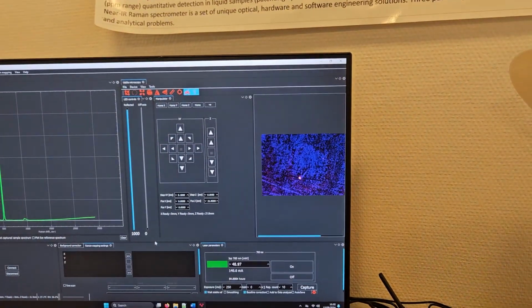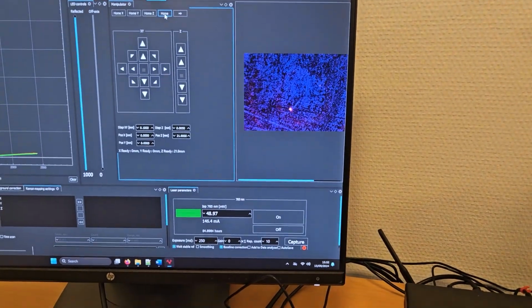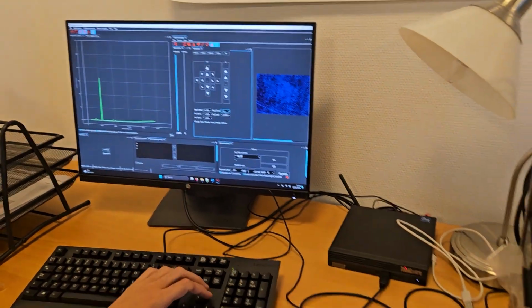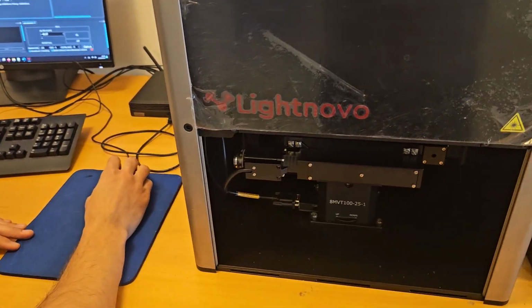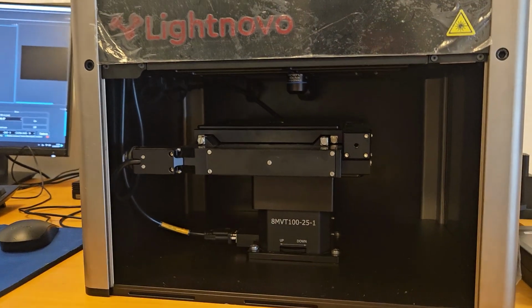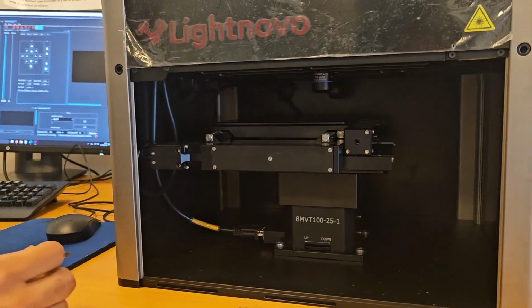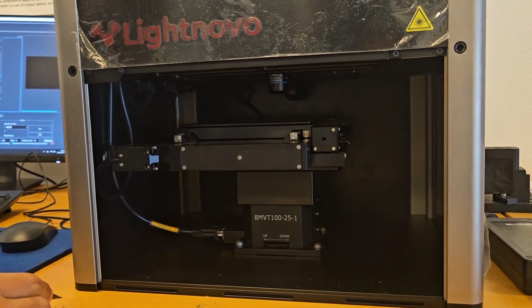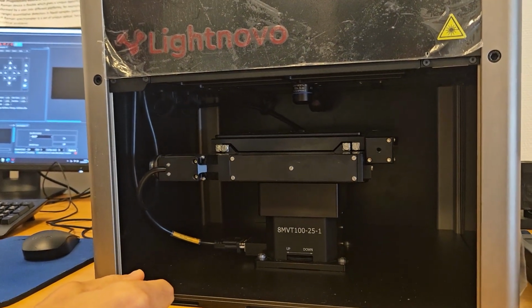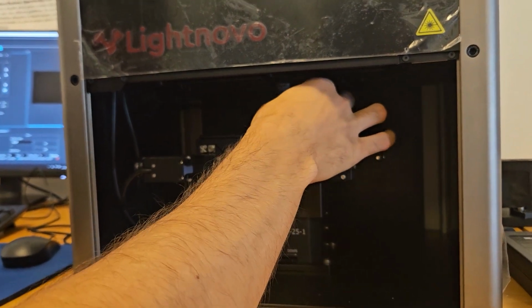So let's probably change the sample and let's go to polystyrene. So Pascalis, please switch the laser off to stay on the safe side. And now, yeah, you can move the stage probably. So move the stage down. Take the sample out with the tweezers. Did you home the stage? Yes. Okay. But in principle, it's just okay to move along the Z direction. You can move down, no need to home it every time.